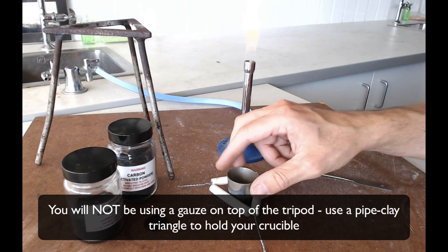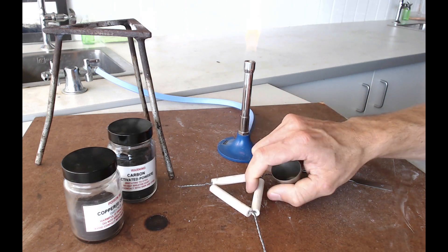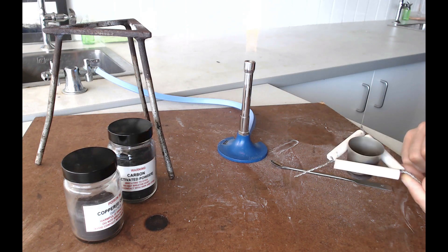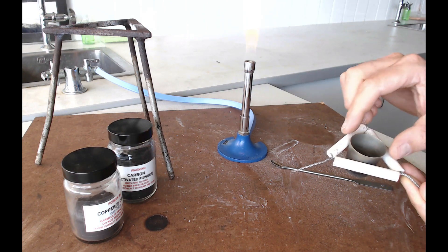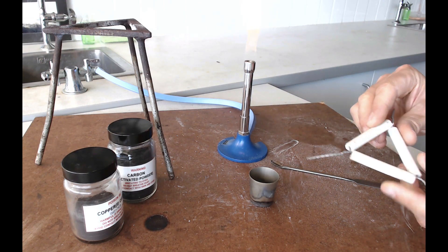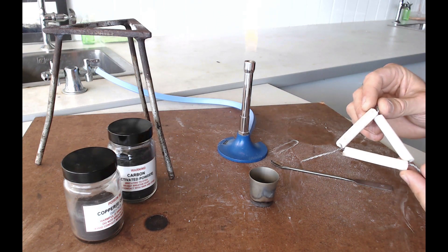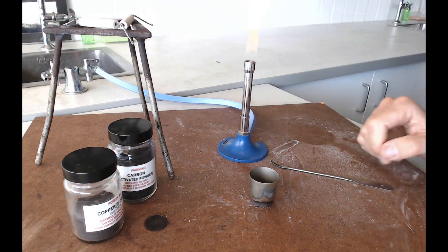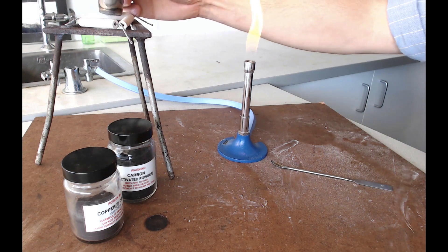So first of all, check that your crucible is not going to fall through your pipe clay triangle. If it does, get yourself a smaller pipe clay triangle or sometimes if these pipes are a little bit broken you can actually bend it a little bit to make it a bit smaller. Okay, put your pipe clay triangle on top of your tripod and then put your crucible inside it.